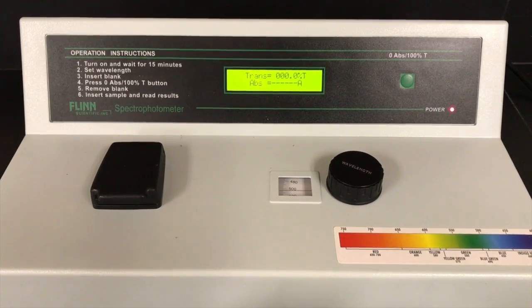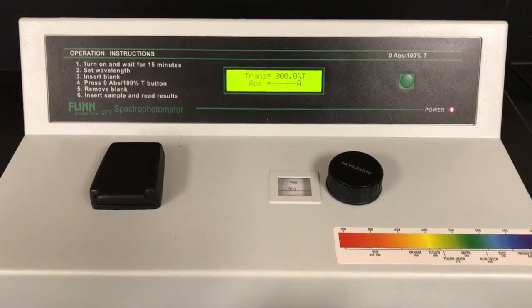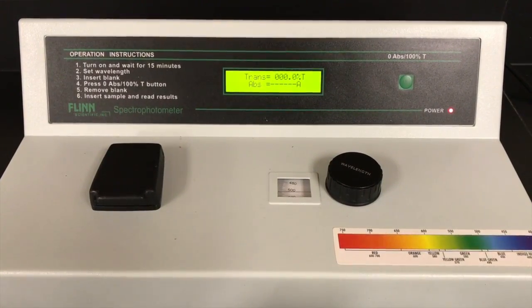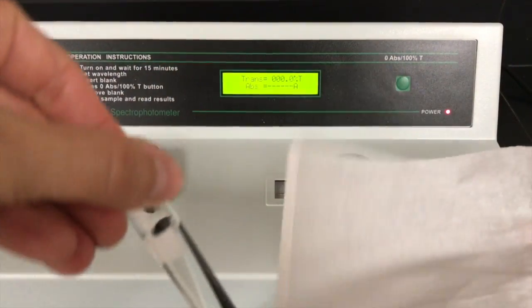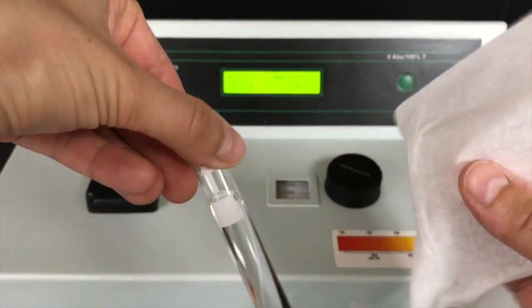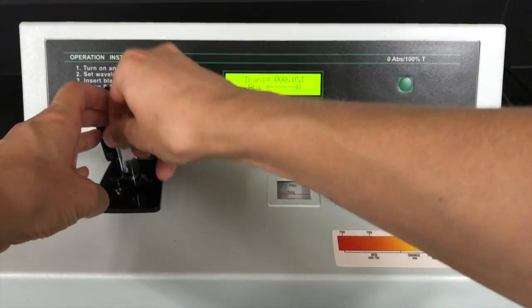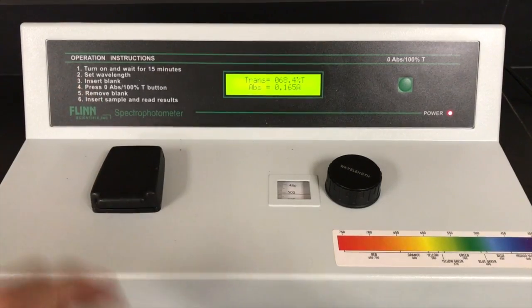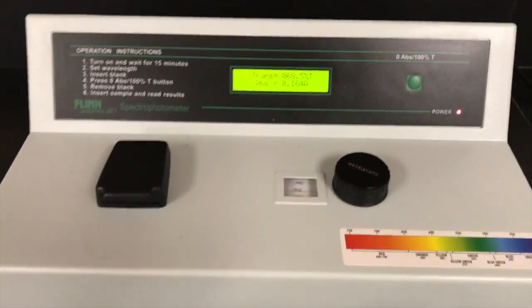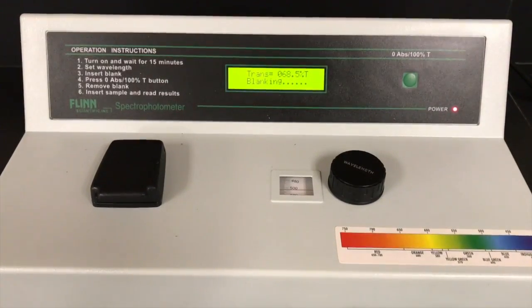So this is the spectrophotometer. So what we're going to do is we first need to zero this. Okay? So the way we're going to zero it is we're going to add a solution of just water. Okay? So for each case, just in case there's water, you're going to take a Kim wipe and wipe it off. And then you're going to open the spectrophotometer and carefully, don't push too hard, push the sample in. Okay? So if you notice, it's not at 0 right now, so I'm going to hit 0 for it to zero.